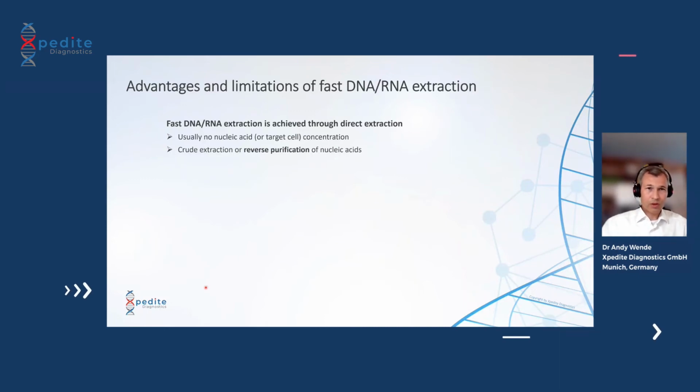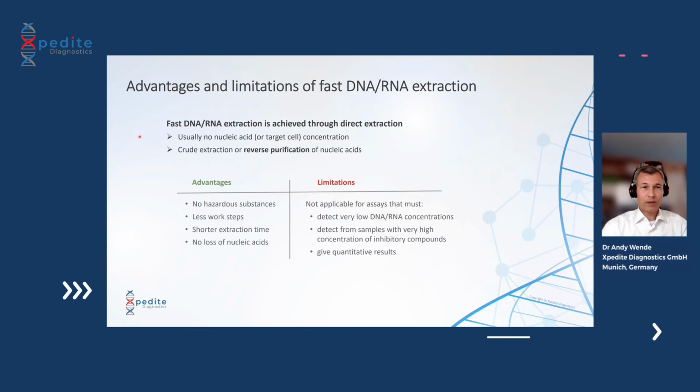Again, usually the advantage is, of course, maybe I unveil this. The advantage is you do not have hazardous substances like the chaotropic salts or alcohols. You often have much fewer work steps. The extraction time is usually much shorter because you have to work through fewer work steps. And this is also a point that not many people know.